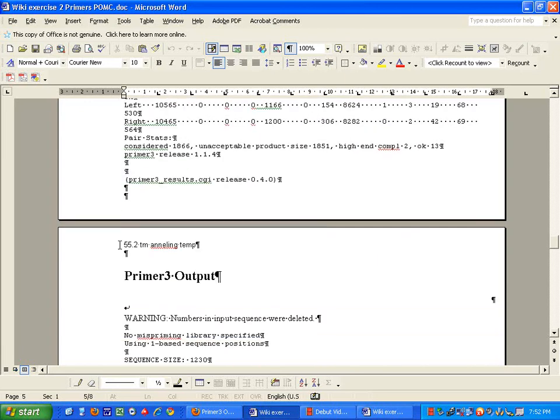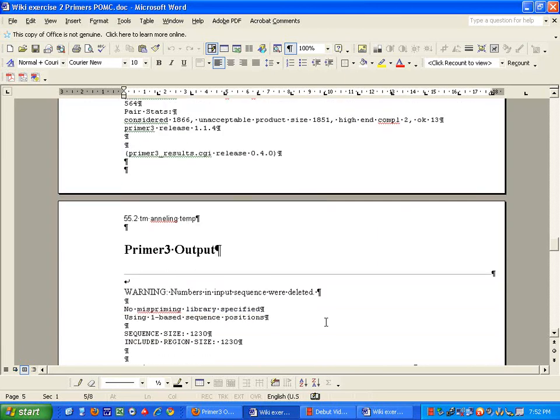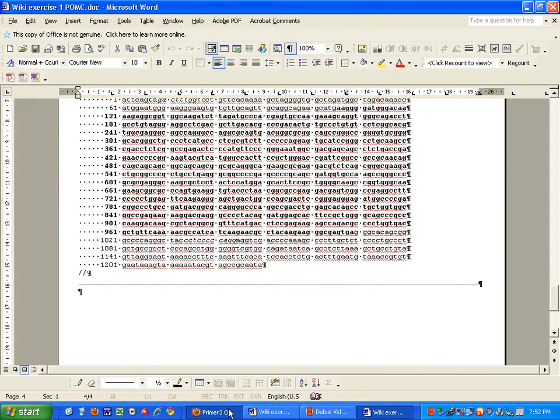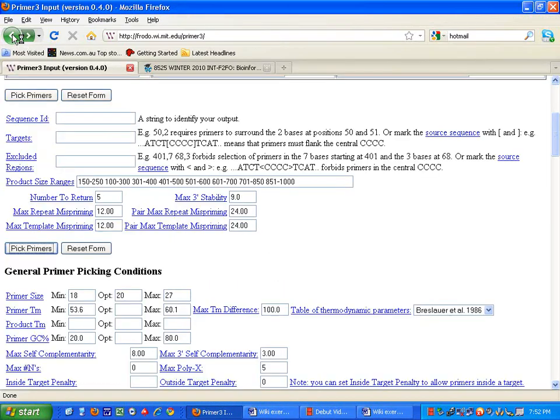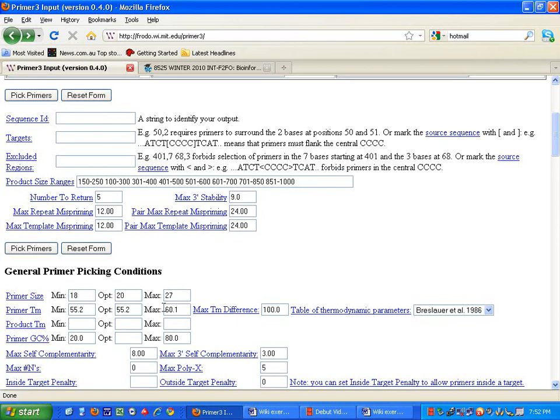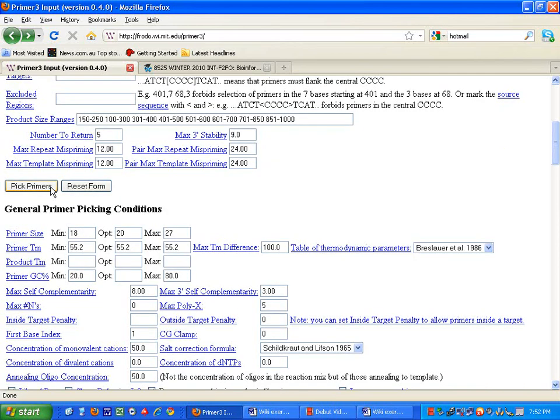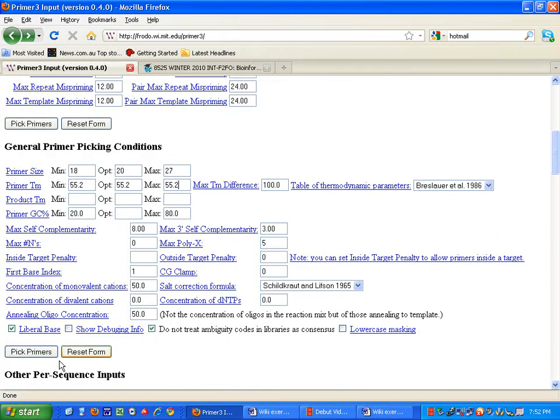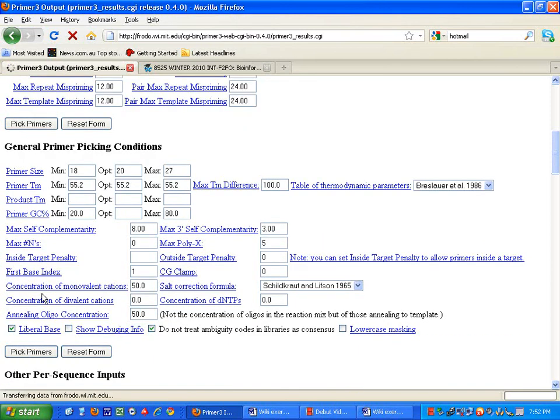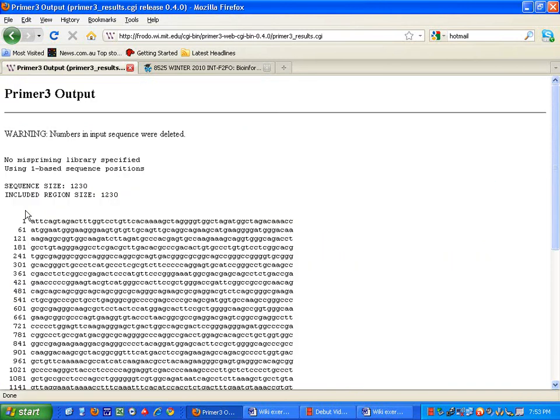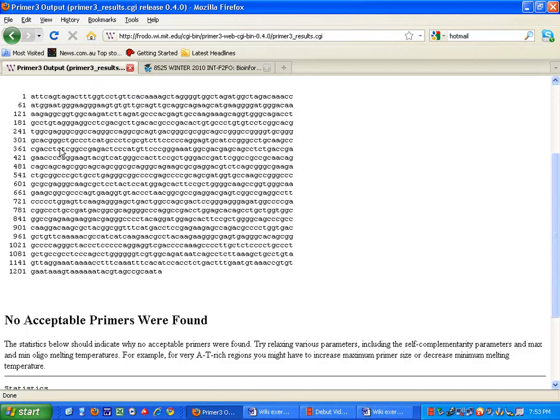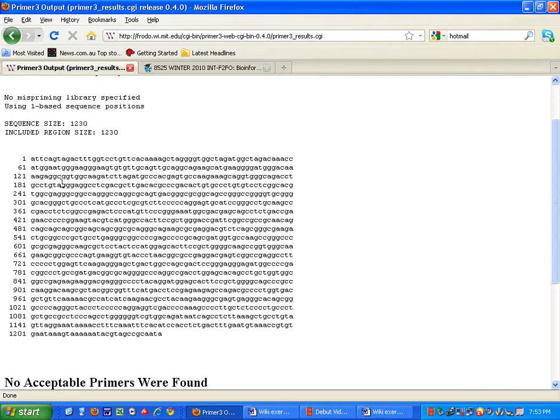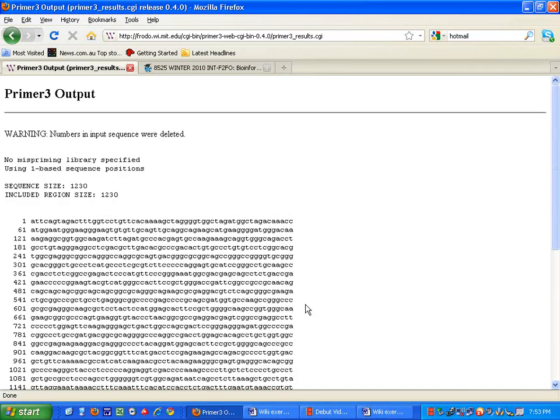Now, if we're looking for a 55.2 annealing temperature simple, which is the next one, I'll just follow the same thing. We'll go back. And we're driving it to 55.2. As you can see, I'm placing the minimum, max, and the optimal all at one. If not, the program does not listen to you and doesn't do what you want. As you can see, it doesn't like it and didn't generate any primers at all.